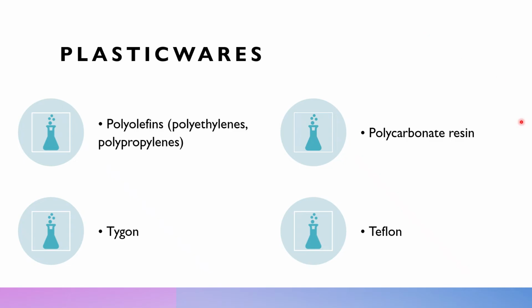In most laboratories, glass or plastic that is in direct contact with biohazardous material is usually disposable. But in the event that it is not disposable, then it must be decontaminated according to appropriate protocols set by the agencies of the laboratory. Should the need arise, however, cleaning of glass or plastic may require special techniques.